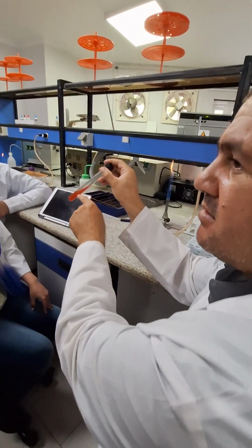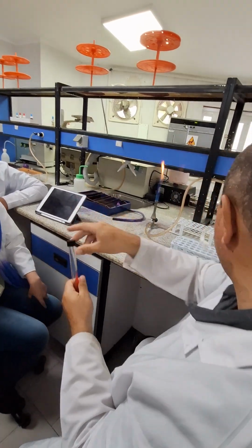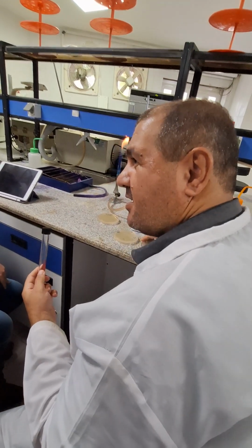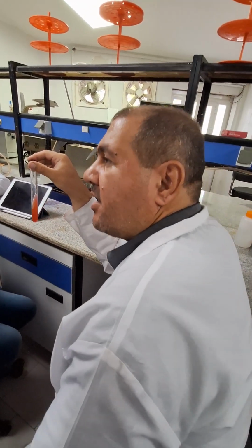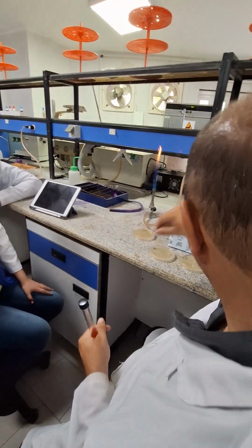Slant medium. The name of the medium is mannitol salt agar, MSA. Mannitol salt agar.